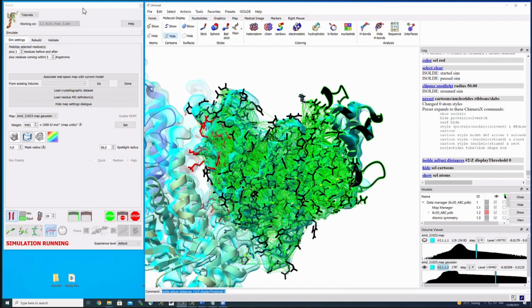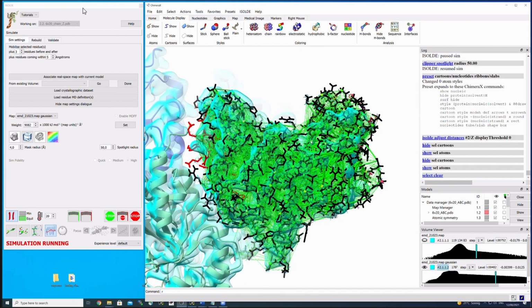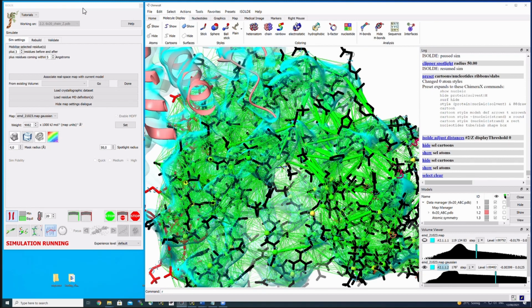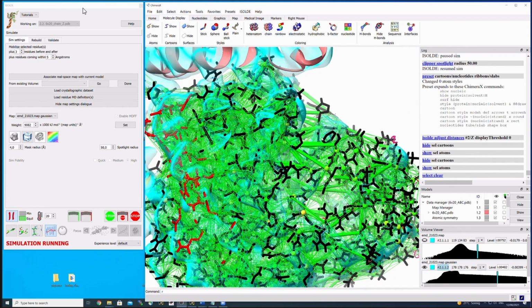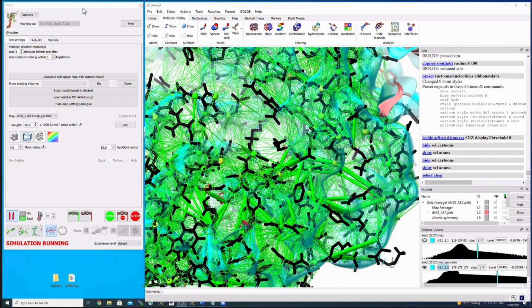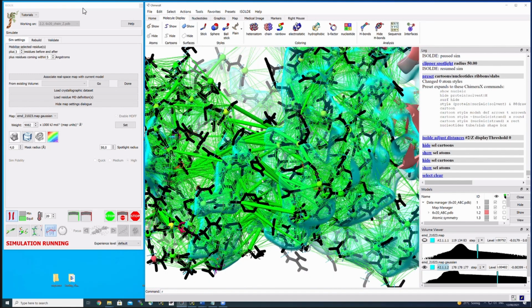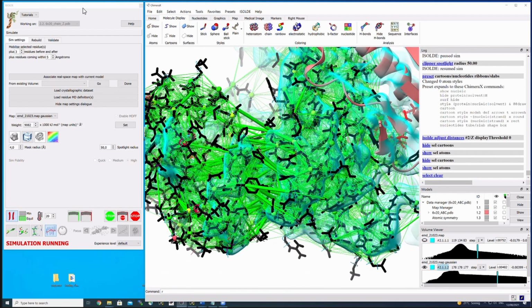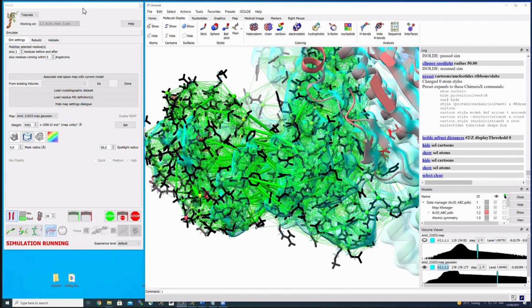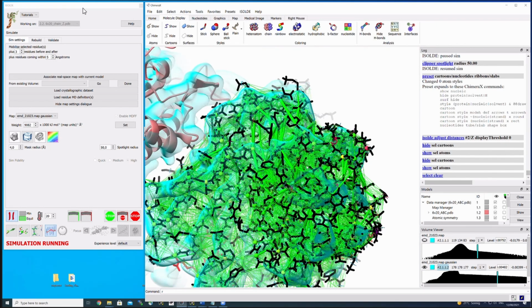So here it is. Here you now see the restraints acting on this model, and you see how strongly they are pulling to keep things together and to keep things happy. And this is mostly where you see them acting very strongly: where you have secondary structure elements in which the density is not super strong. So the information of the map is just not extremely good. And if this is the case, then you need more of the restraints to compensate for the weaker map.